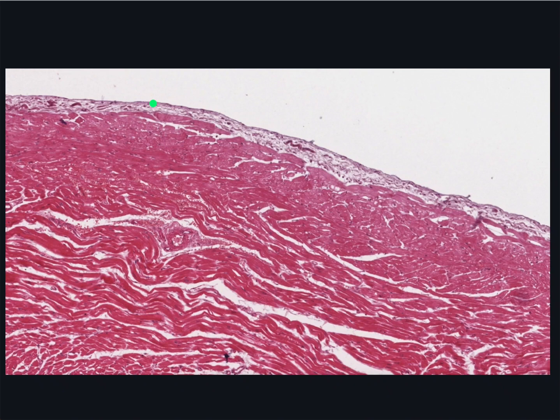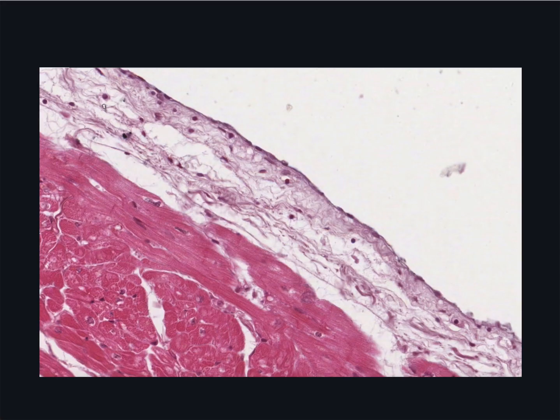The endocardium is a thin layer consisting of an endothelium and some underlying connective tissue. It varies in thickness from place to place and is normally much more developed in the atrium than in the ventricle. Endothelium is a simple squamous epithelium with elongated or flattened nuclei. It is the special name given to the epithelial lining of blood vessels.